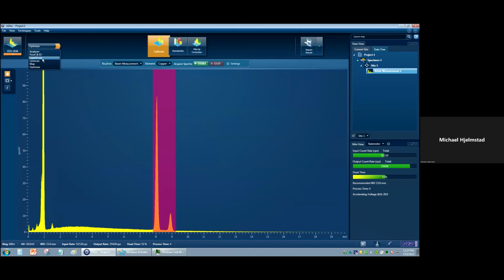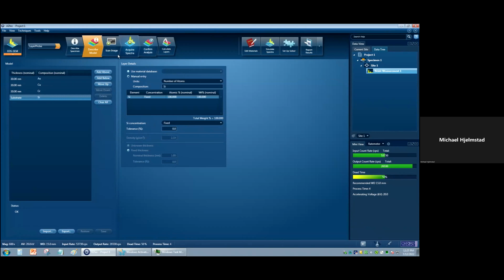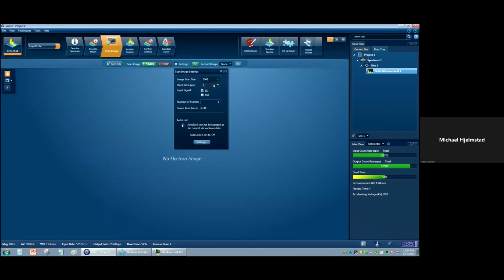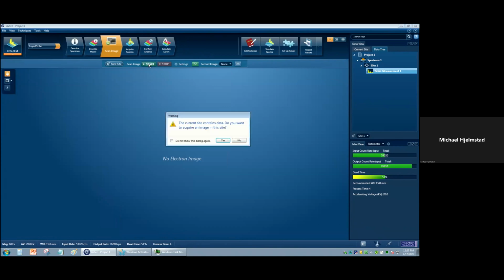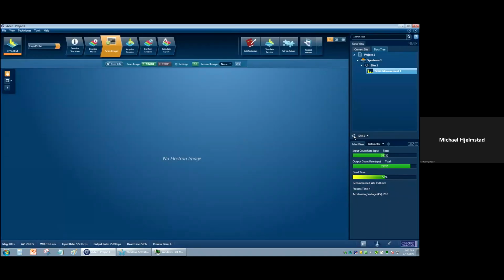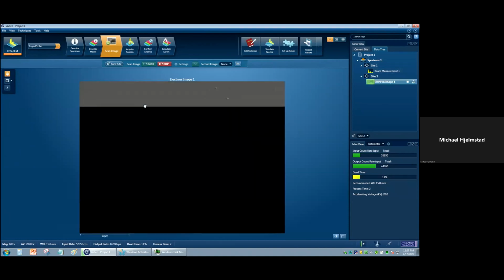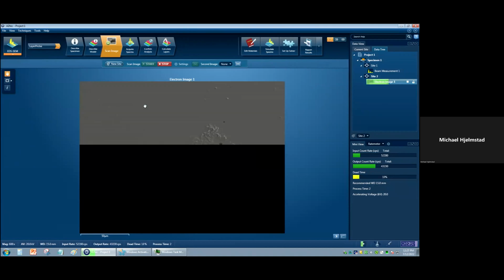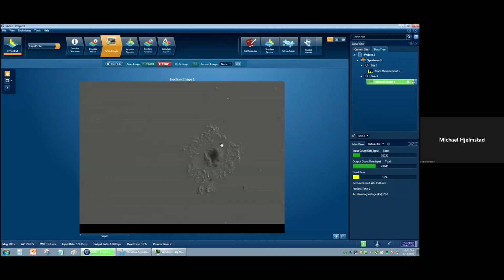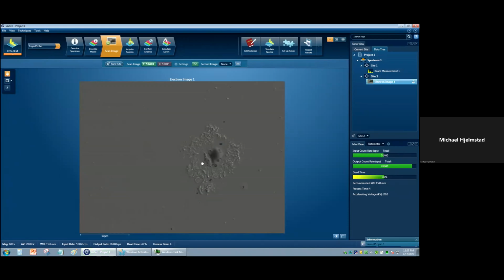I'm going to come over to the Layer Probe, and truthfully, I could run this as if I was in Point and ID here as well. So a little bit ambitious on the resolution there. Let me collect my image. And this is the case where I've forgotten, I do like to keep my beam measurements separate from my actual data. Not a requirement by any means, it's just me. So there's what we're looking at on the microscope. I'm wondering if that's a little pore there.